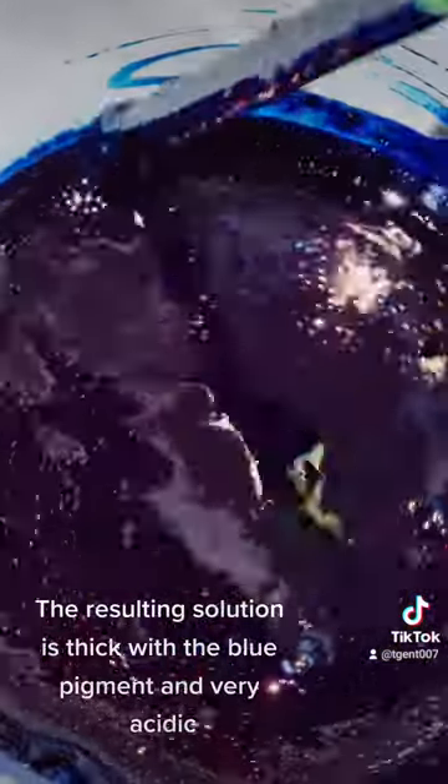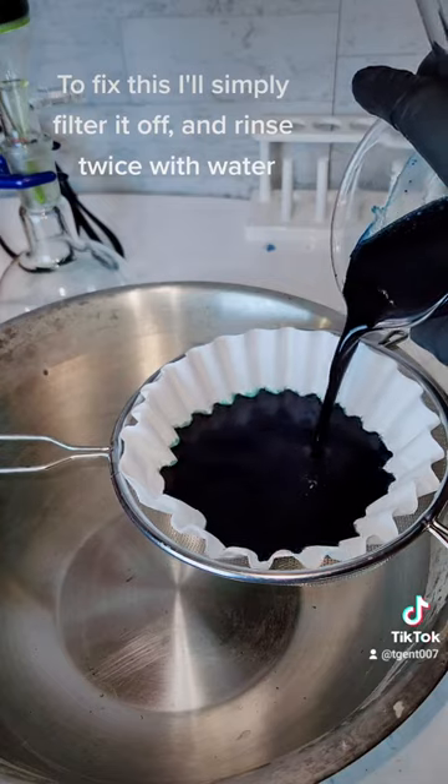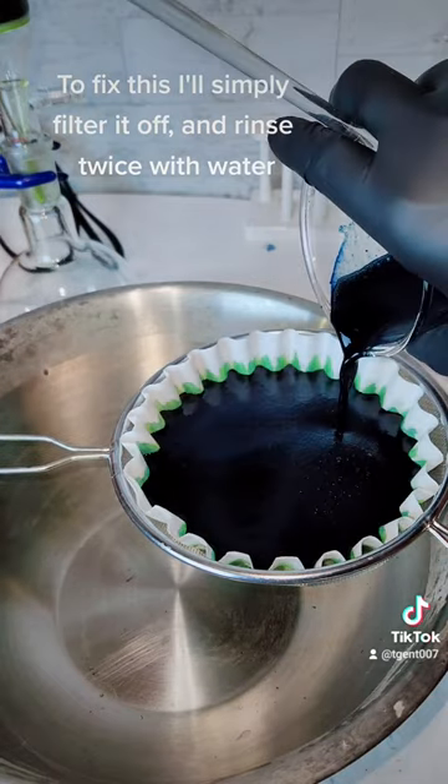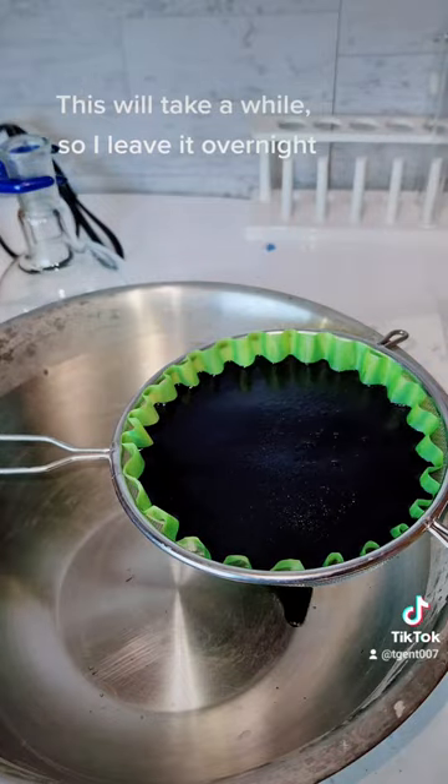The resulting solution is thick with the blue pigment and very acidic. To fix this I'll simply filter it off and rinse twice with water. This will take a while so I leave it overnight.